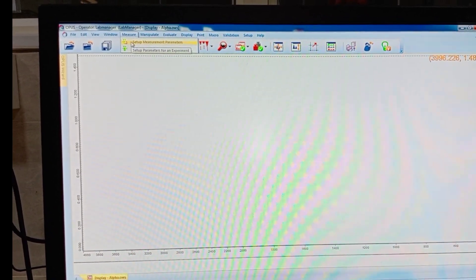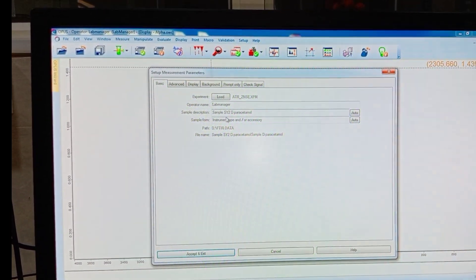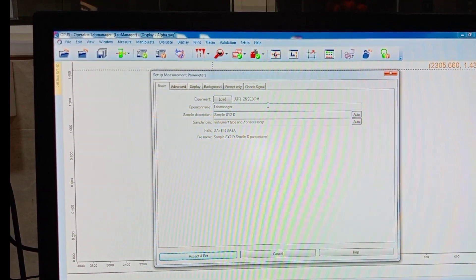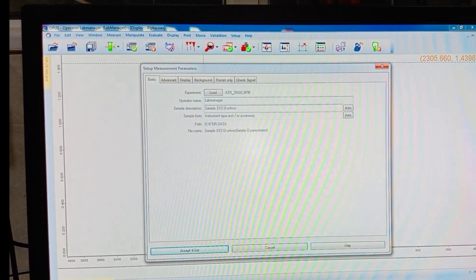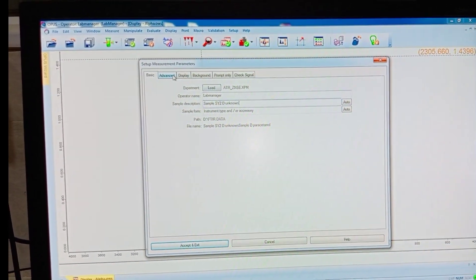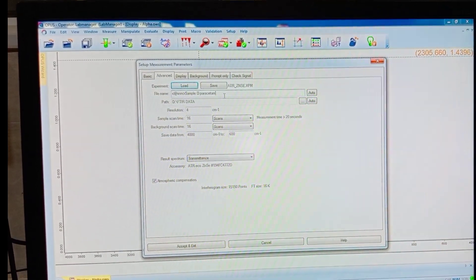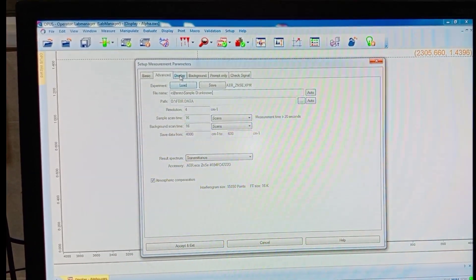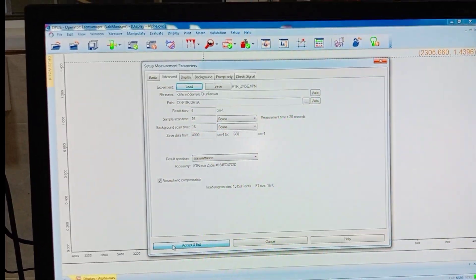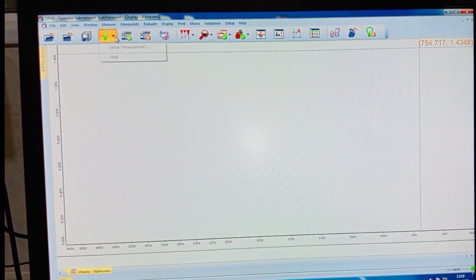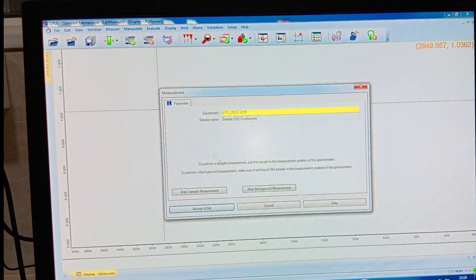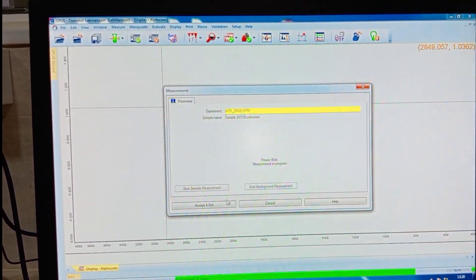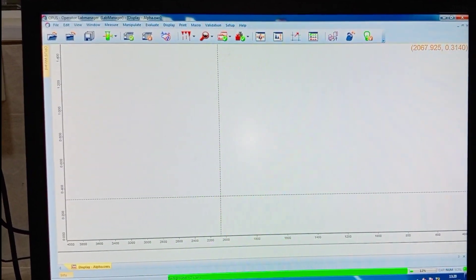Now, go for the setup measurement parameters and write the sample description. I am analyzing one unknown sample, so we have to give the name in the sample description. We have to write the file name and the sample name, then accept and exit. Now go for the measurement parameters and we have to start the background measurement.